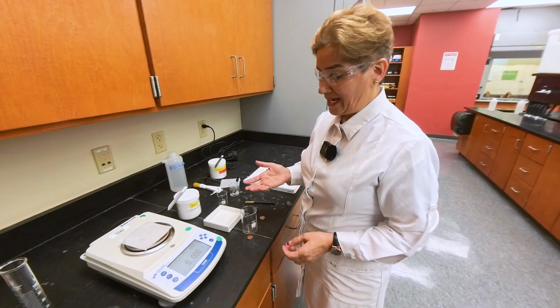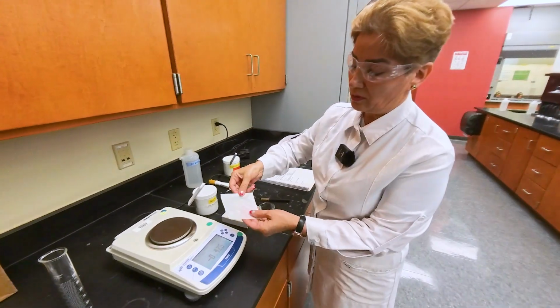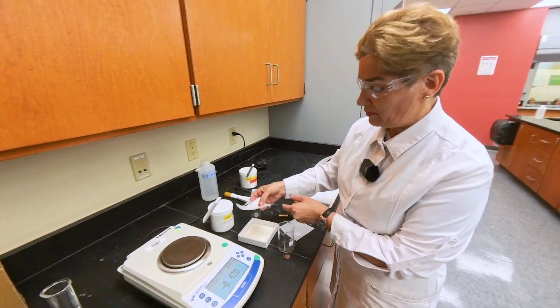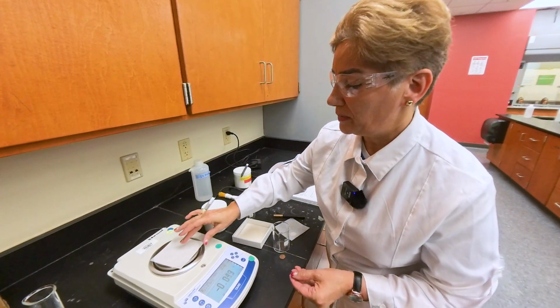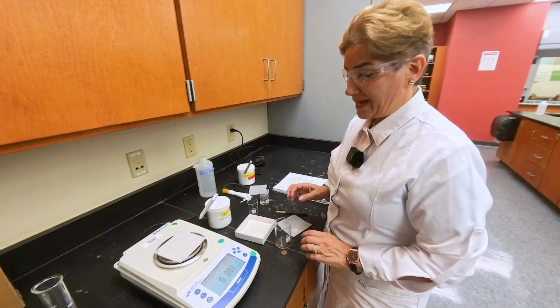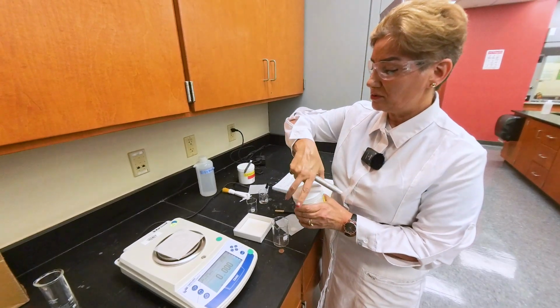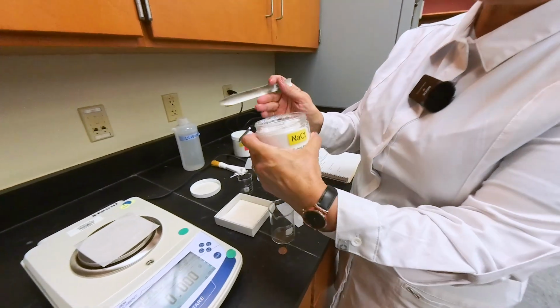2.750 gram exactly. I do need the weighing boat or weighing paper. This is like a shiny paper that doesn't react with my chemical when I'm doing the measurement. Always use a clean one for a new compound that you are using. And you place the weighing paper on the scale. You do not need the mass of the weighing paper in this case, because you just want to measure 2.750 gram.